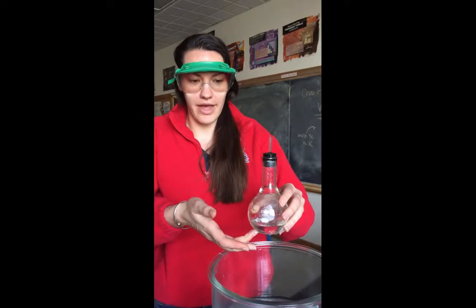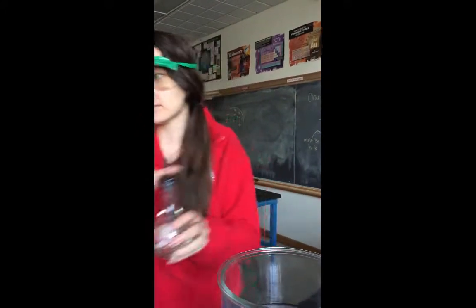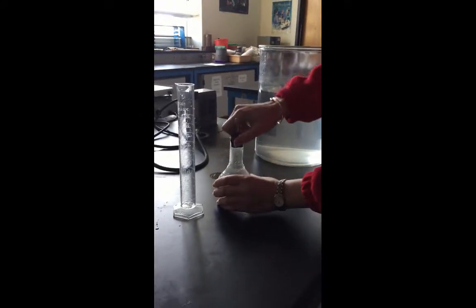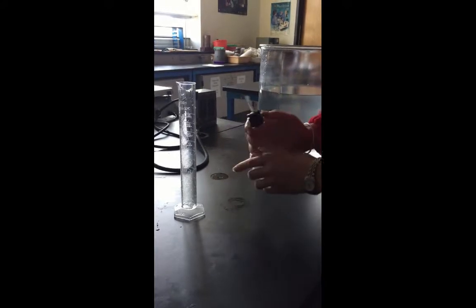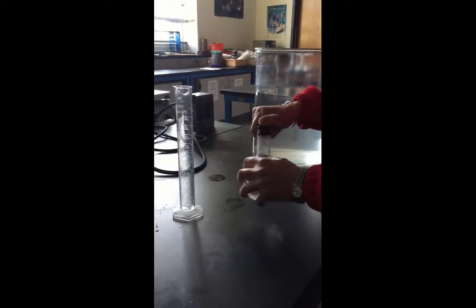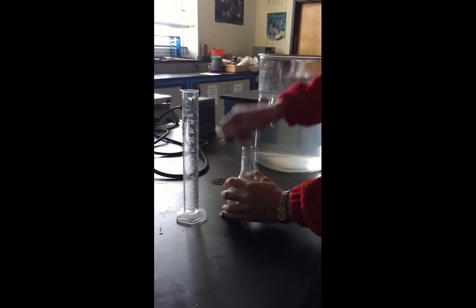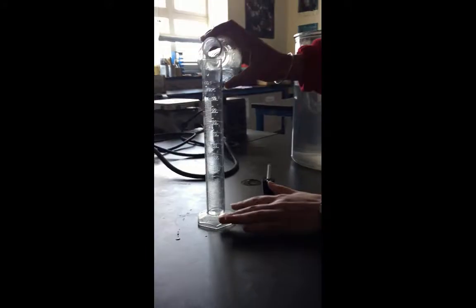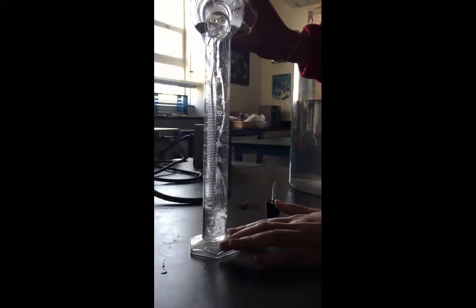Now we're going to take the stopper off, which is hard, and measure the volume of water that came into the flask.